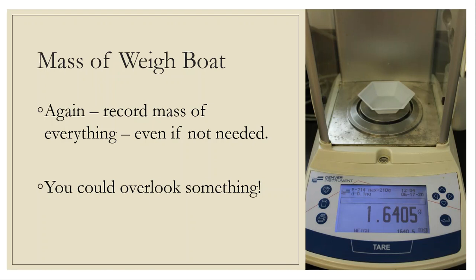I'm going to measure a weigh boat. So I've tared the balance again, 0.00000, and then I put a weigh boat on it, and that weigh boat weighs 1.6405 grams. Again, I might not need that mass, but I at least did it. I'm going to write it down so that if I do need it later on, I've got it. So there's the mass of the weigh boat.